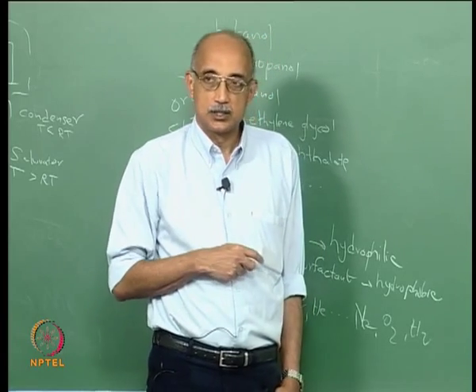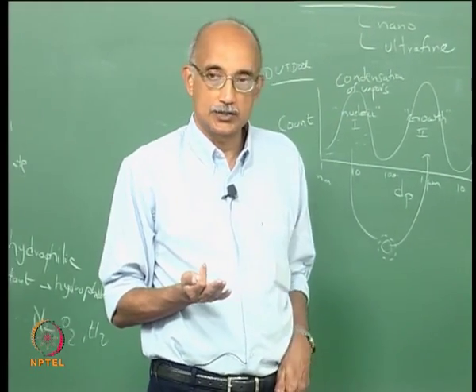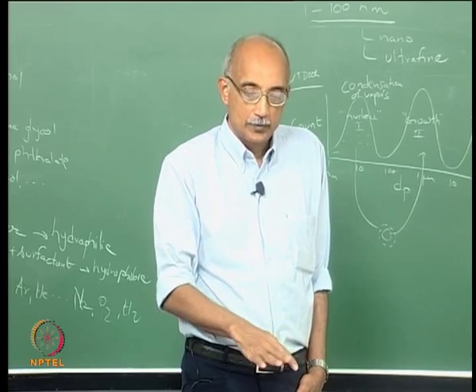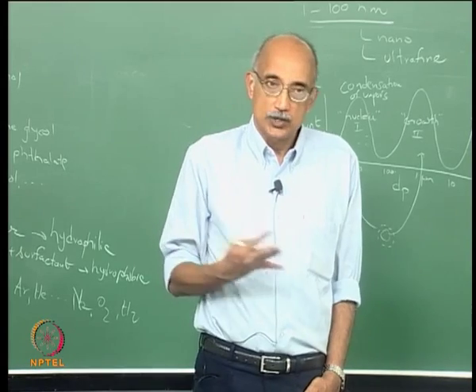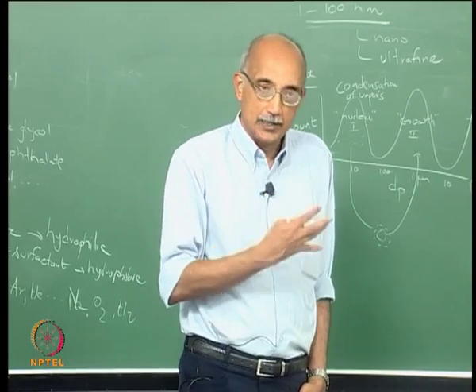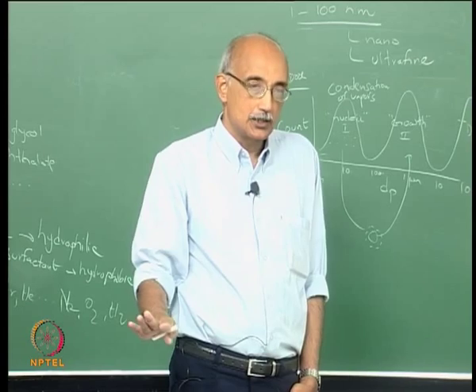How about surfaces? If you are trying to characterize presence of ultrafine particles on a surface like this, again the same difficulties exist. Light scattering, now you have actually a double jeopardy. Light scattering intensity from the particles is very low, but at the same time the noise, which is the scattering from the surface itself, is very high. So, use of light scattering techniques to detect ultrafine particles on surfaces is even harder than detecting them in gases or liquids.